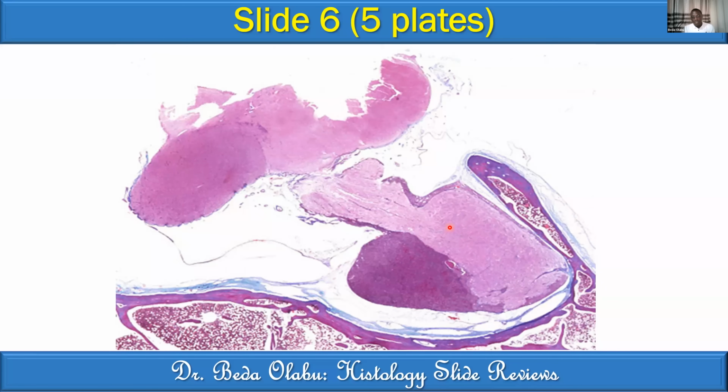So you talked much about the pituitary gland theoretically. For identification, we rely on you being able to pick the two sides, the two parts. In some slides, you may be able to see a cleft. If you see that cleft, you talk about it. Then in some slides, you may be able to see a rim of deeply staining cells on the side of the fibrous portion. When you see that, you talk about it. That's the pars intermedia. It's not in these ones.